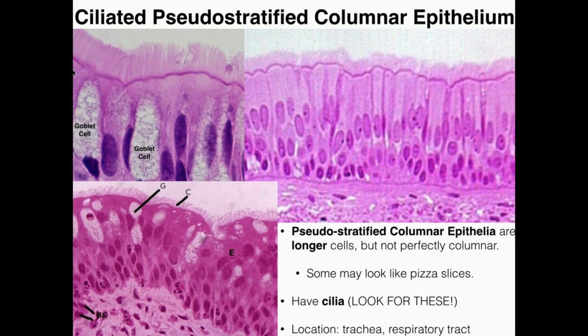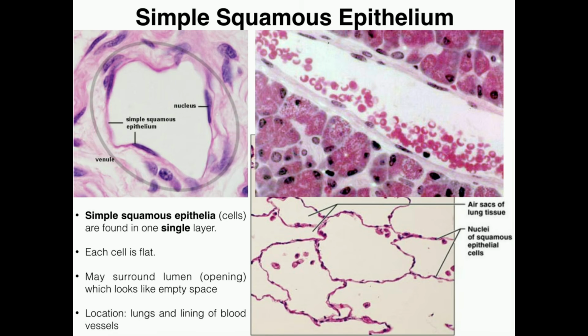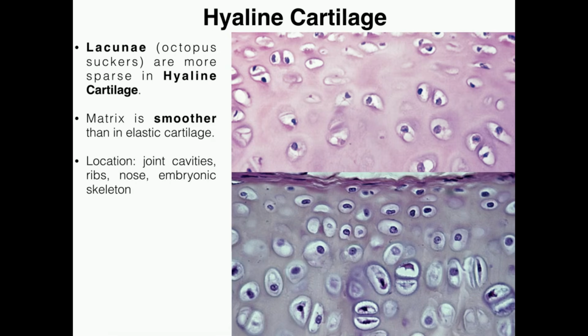Okay. Another important thing to make sure that you do when you're studying these is don't memorize these tissues by their color, because the color that you see in the slide depends on the scientist who stained it. There are different stains that you can use for the same tissue, and so the colors may look very different. An obvious example of this is usually seen with the cartilages.